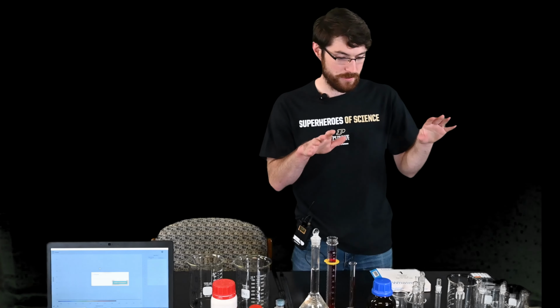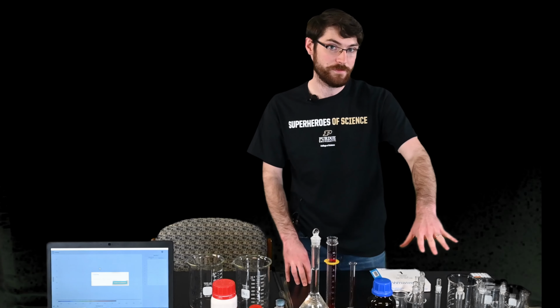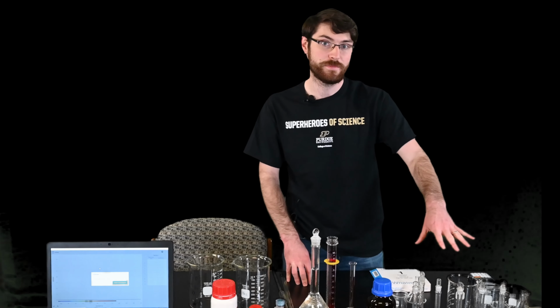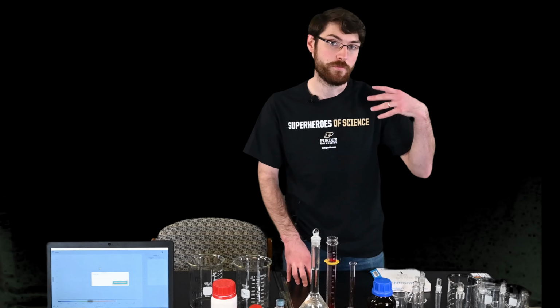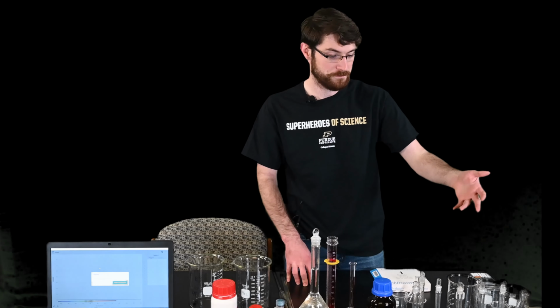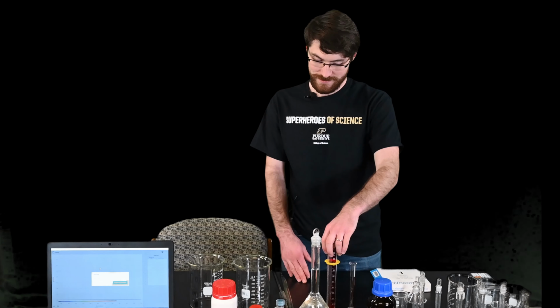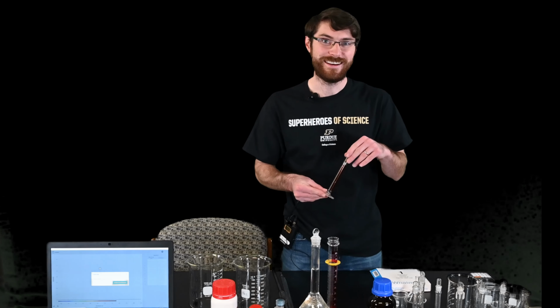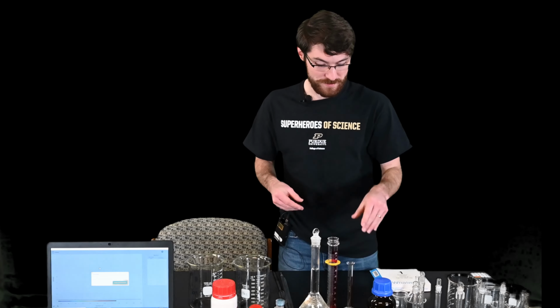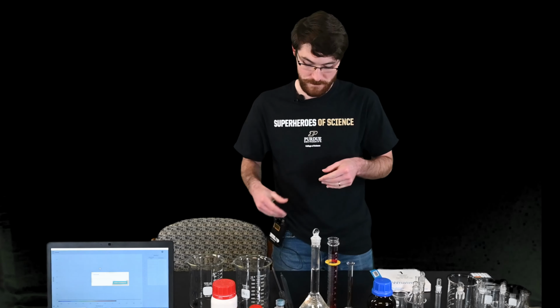We need then our volumetric glassware. So ideally, you will be using volumetric flasks. I've got an assortment of 100 milliliter volumetric flasks here for making our standard solutions, and then for preparing our diluted sample solution. You'll need graduated cylinders, there we go, for measuring various volumes of solution. These do not have to be super precise, but we will use the graduated cylinders to get a rough idea of what those concentrations are.